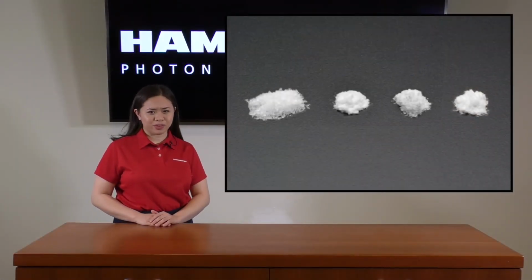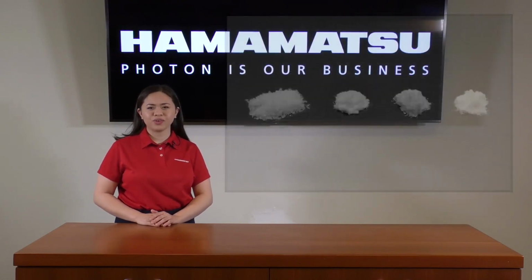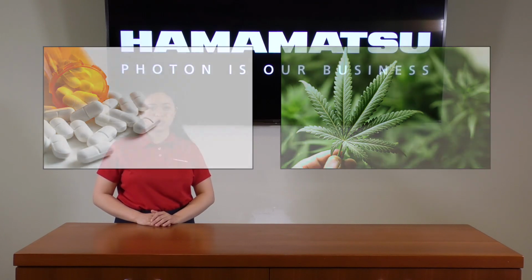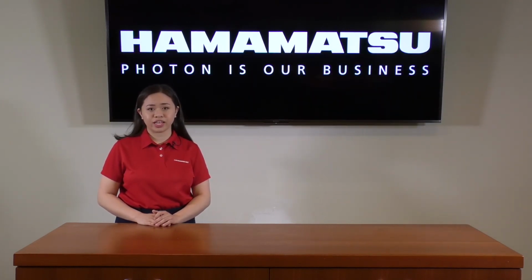Are these powders different medicines, or the same medicine in different concentrations? How can we distinguish visually identical samples? With the rise of opioid abuse and the developing legalization of marijuana in the United States, tools for quickly and accurately identifying a sample can be the key to saving a life or succeeding in a new market.